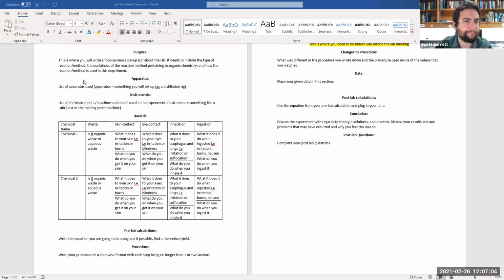The main idea is that firstly, we want to make sure all the chemicals we're utilizing within the lab, we understand that even though we're only performing this online, we need to understand that if we were going to be walking into a lab, what safety precautions we need to perform in case we spilled it, or in case it became, as here, skin contact, eye contact, inhalation, or ingested, what we should do upon those things. So these are the safety precautions we need to understand for experiments.